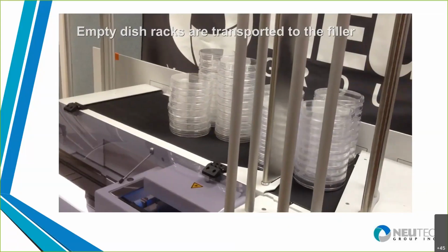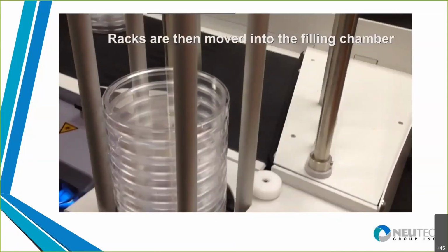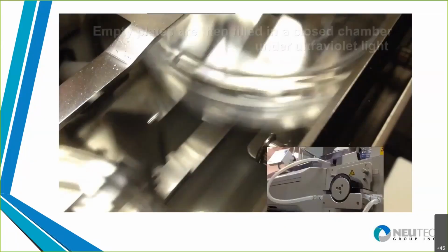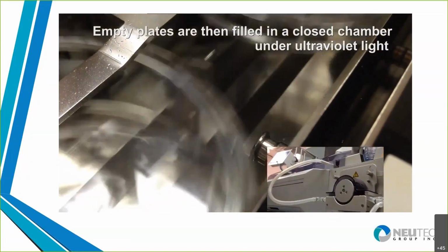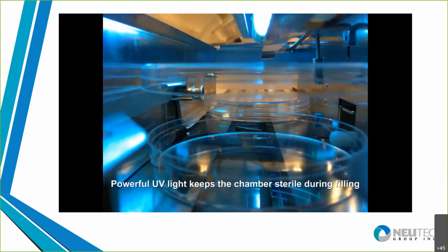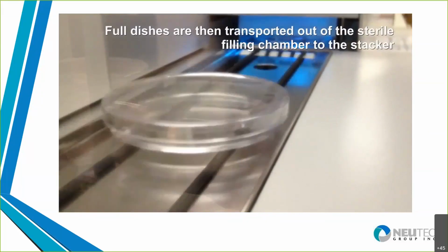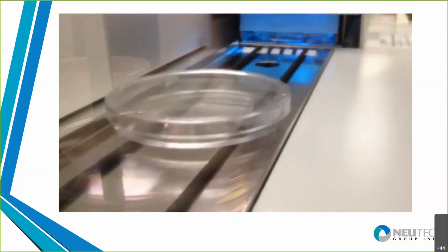So you put the petri dishes on the loading platform. Again, any stack, it doesn't matter the numbers. The final stacks are going to be dictated by how you program it and how you set that up. And then each dish is brought in and filled with the media. Again, that media can be coming from several different sources, including the media preparator that we saw earlier. When this media is being filled, it's done under UV light so that it keeps the chamber sterile, so you're not having issues with whether or not the filling process is avoiding contamination, and it's keeping the media safe and sterile and ready for use.